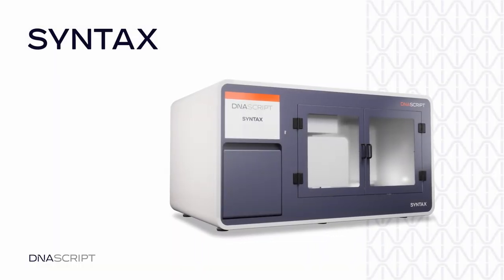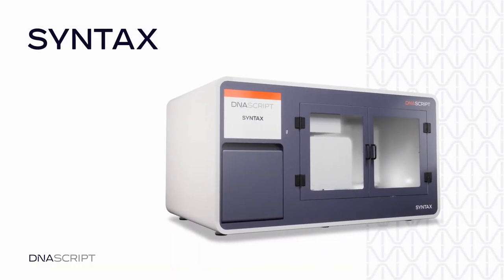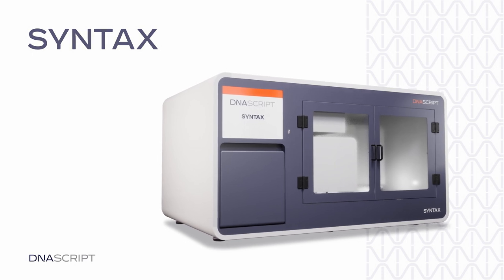DNAScript introduces the Syntax system, the world's first DNA printer powered by enzymatic DNA synthesis.